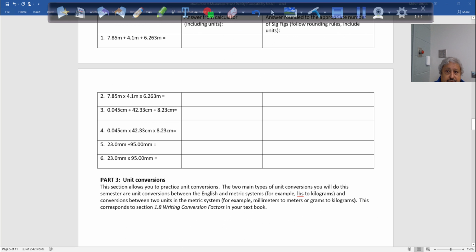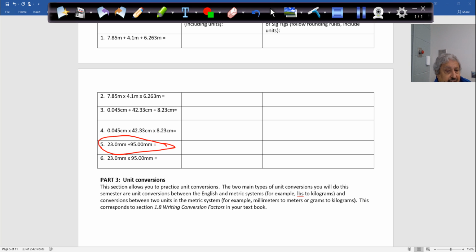How about the other ones before we leave this one here? You can do this one here at home, we're not doing it because we want to finish reading those and the balls here, the stainless steel. So now how many here is what we have here? Tell me what we have here. 5, number 5.